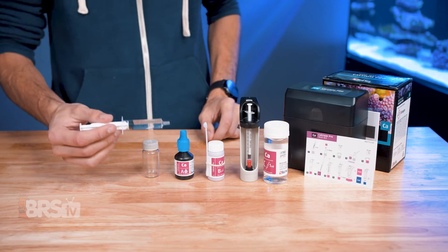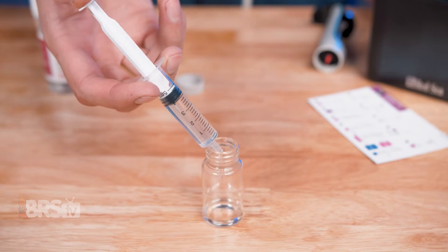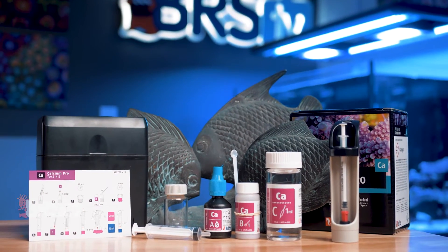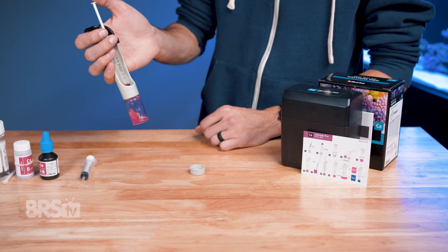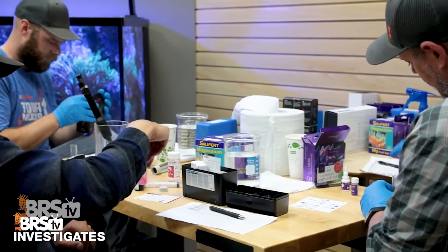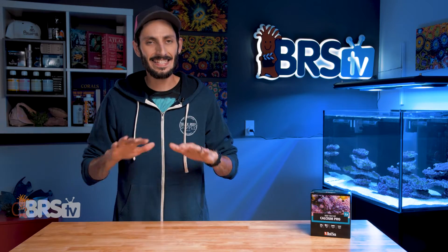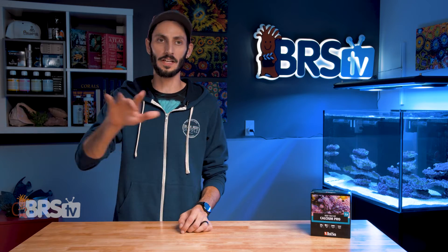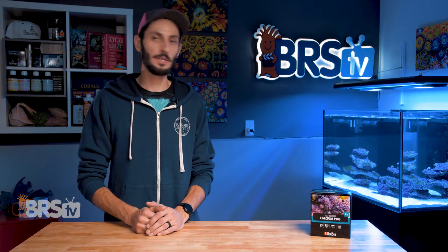Red Sea's Calcium Pro Test Kit is phenomenal. It uses a larger five milliliter sample of water and premium components, making for a test that is easy to perform, easy to read, and produces consistent results regardless of a reefer's experience level. It is hands down my all-time favorite calcium test kit. I've been using it for years and I still prefer it over all the other test kits that are available.